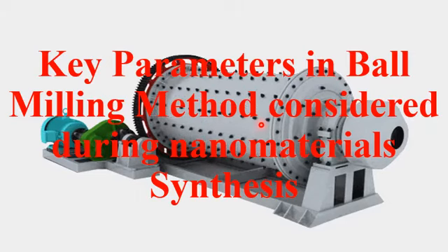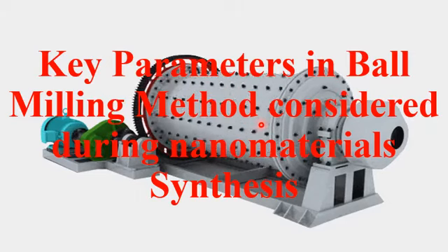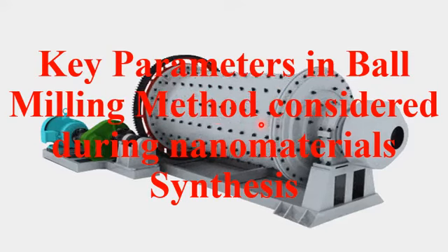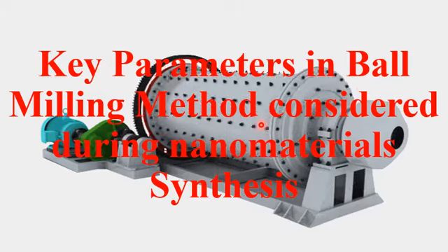These are very important, and usually in research students must consider the physical parameters associated with ball milling to prepare very fine, very precise and uniform nanoparticles. Ball milling is usually based on three main physical parameters.